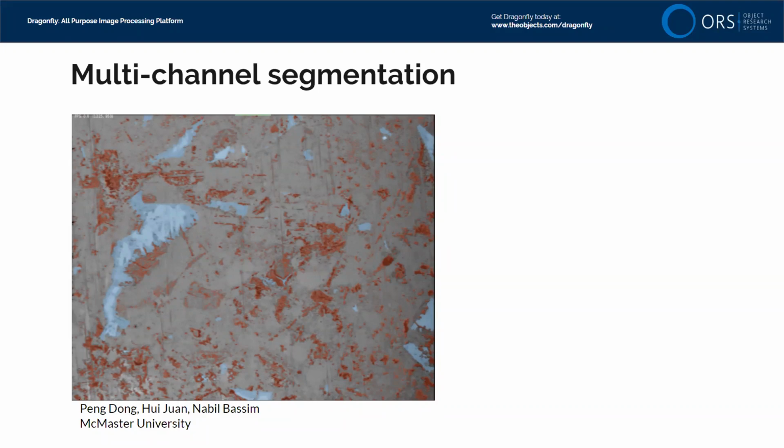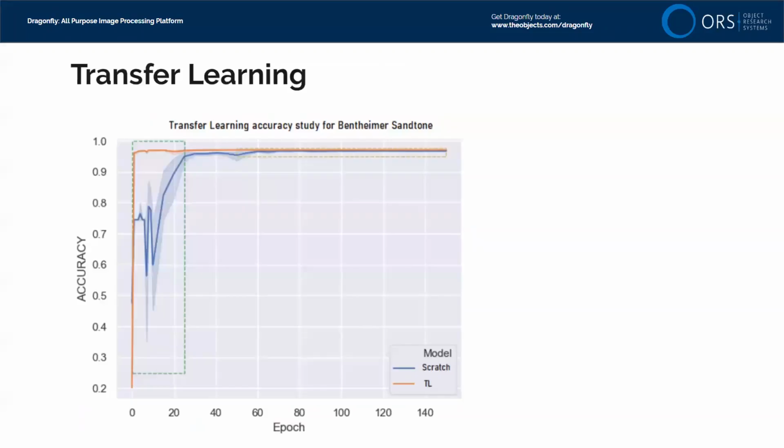And so it might learn that I never should look for receptors when I'm more than, I don't know, a couple hundred nanometers from the surface of the membrane. You can have lots of examples where you can benefit by encoding distance as a parameter in the input. Maybe we could have a special lesson on that.